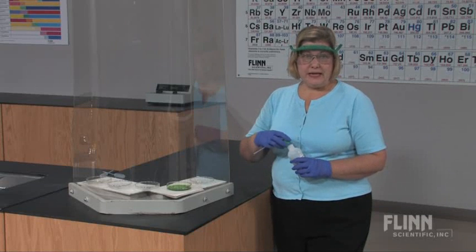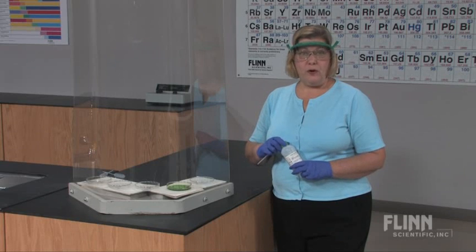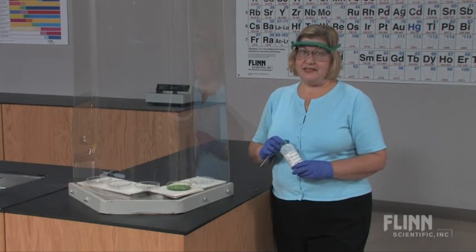Second, immediately cap the bottle and remove it away from the demonstration area before lighting or attempting to light the salt solutions. This is imperative.